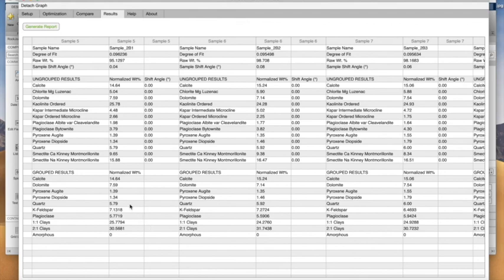I'm getting 5 or 6% quartz for these analyses, and in this mixture, they're supposed to be 5%. For the K feldspars, it looks like we're picking up around 6.5 to 7.5-ish%. And it turns out that for K feldspar, about 7.5% is what it's supposed to be.